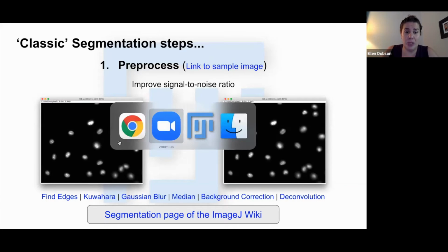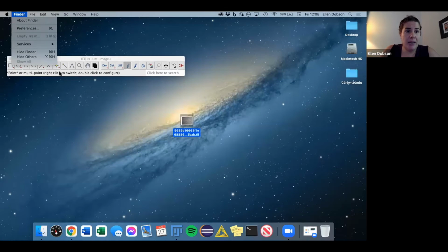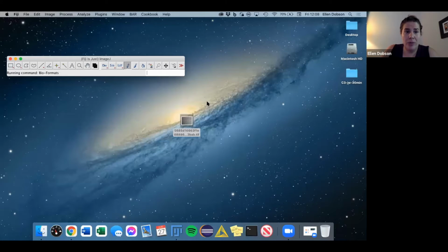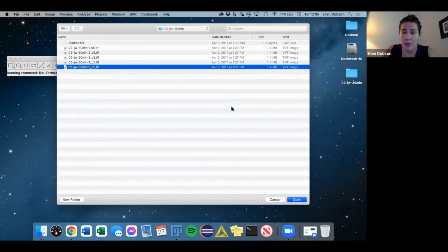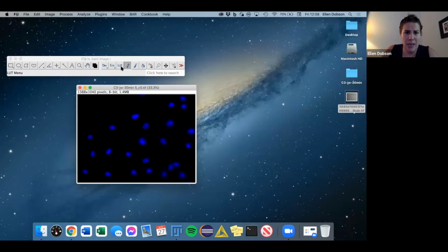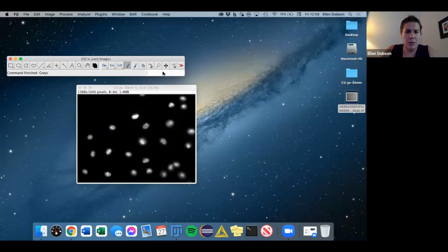So the first step, we're going to open Fiji and run it here. So I've got this guy. That's my image. I'm going to go ahead and open him via bioformats. Again, number 5 is the image you want to load. Oh, sorry, it's not this image. It's in the folder. That's the other one. This is a different example. Okay, so I'm also going to shrink this down a bit. And I'm going to change the LUT to grays. It's just easier for me to see.